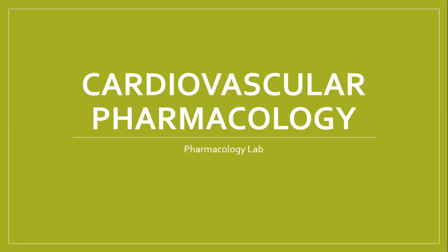Okay, so the first preparation that we have over here is the isolated heart preparation. This isolated heart preparation is also called Langendorff's heart preparation. When the word Langendorff comes, it means a certain assembly which is used to test what effect drugs have on the heart.